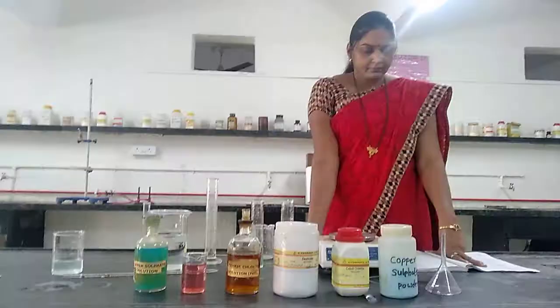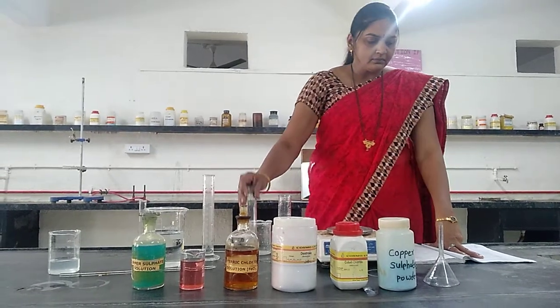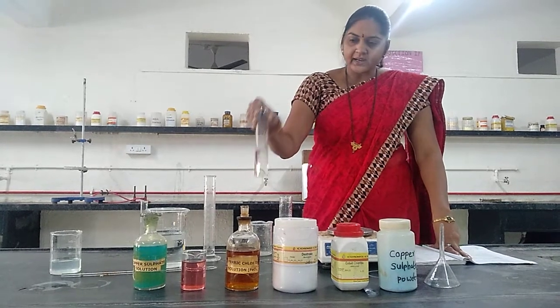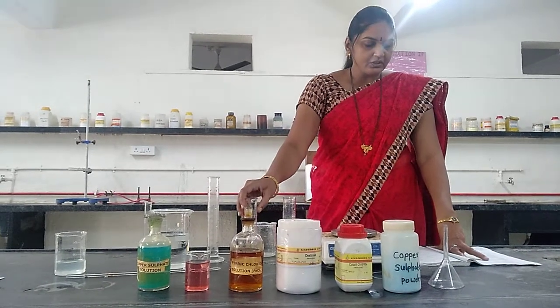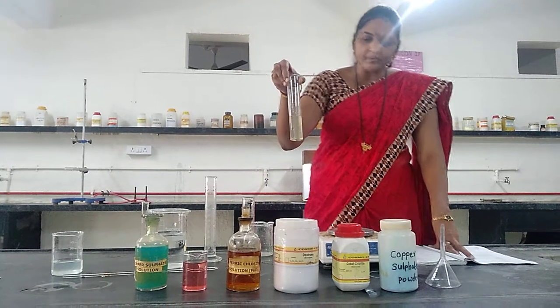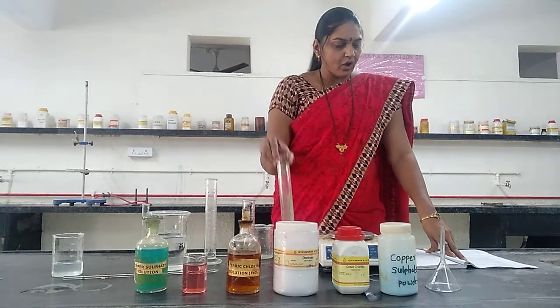Dextrose anhydrous. Nessler cylinder 1, consisting of the sample, is colorless, this is the observation, and Nessler cylinder 2, consisting of the standard, is observed to be a somewhat light brownish color.